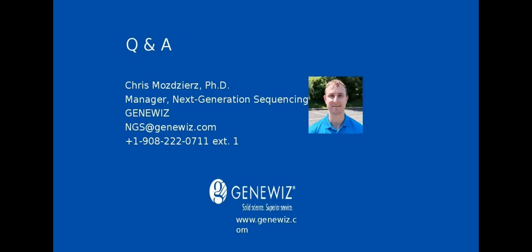So another question would be, how accurate is PacBio sequencing in detecting small differences such as SNPs? That's a great question, and the accuracy of PacBio is determined by two different factors: the intramolecular coverage and the intermolecular coverage. If you're doing amplicon sequencing, researchers typically focus on what's called the intramolecular coverage. This is the polymerase looping around the same molecule many times.